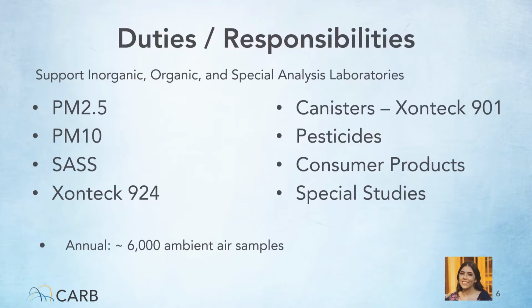Hello, I am Tula Morales. So this slide lists all the programs that we support. Although there is some commonality with each program, there are differences between what analytes are analyzed, materials and supplies used, assembly and disassembly procedures, and the frequency in which sampling occurs. And to give you a rough idea as to our workload, we are currently seeing about 6,000 ambient air samples come through the sample handling room each year.